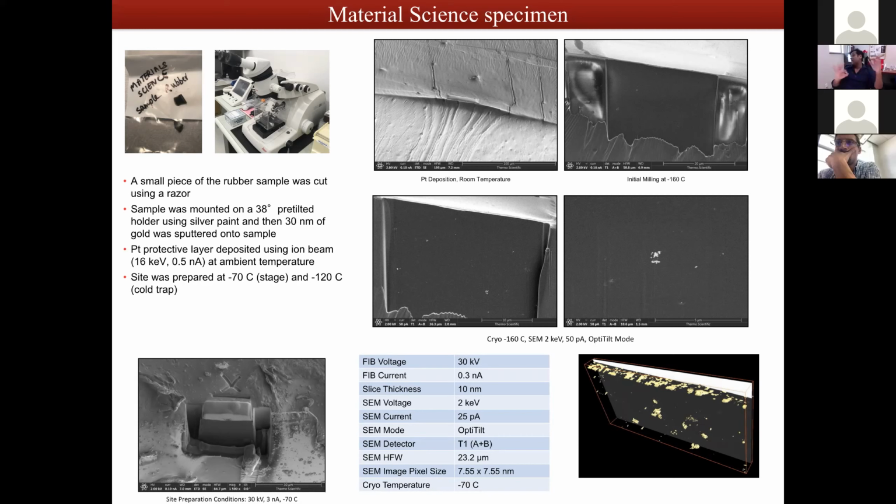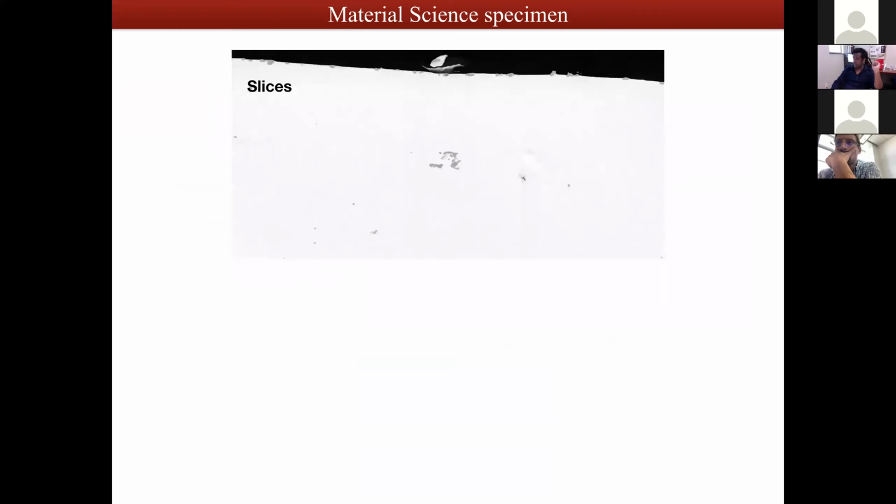All right. On the right-hand side, at the bottom right, you see some yellow densities. Those are the densities represented by the white patches in the second row. Then we collected a stack of images and I did a reconstruction again. And this is what it is. It is actually a movie. Let me start it. Kindly note that I have inverted the density of the whole image set here. This region of interest, I'm not sure if you can see my mouse here, these are the regions of interest. All right, let's just run this. As you can see, we are going slice by slice.